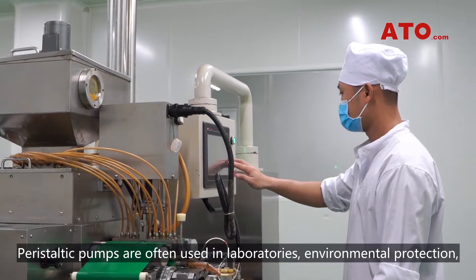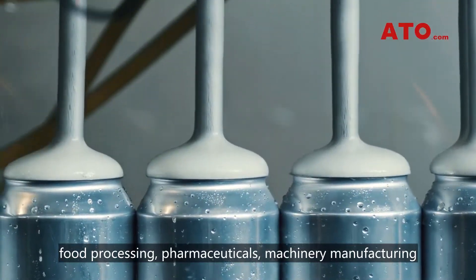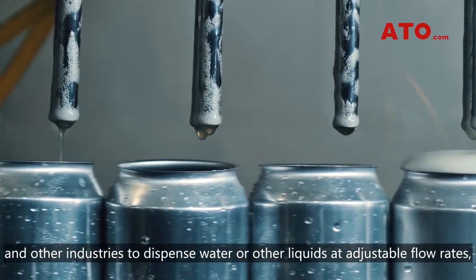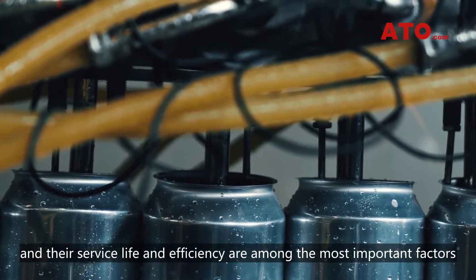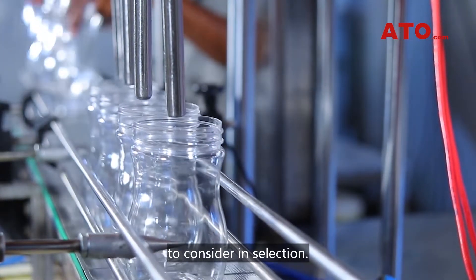Peristaltic pumps are often used in laboratories, environmental protection, food processing, pharmaceuticals, machinery manufacturing and other industries to dispense water or other liquids at adjustable flow rates. Their service life and efficiency are among the most important factors to consider in selection.